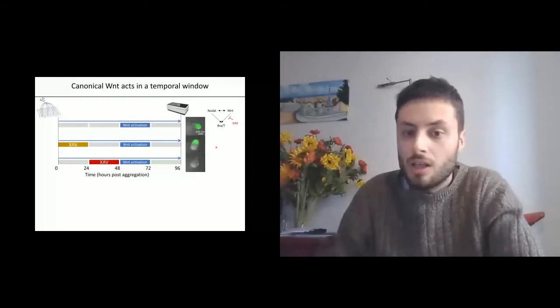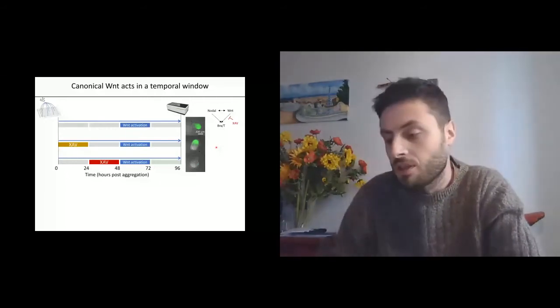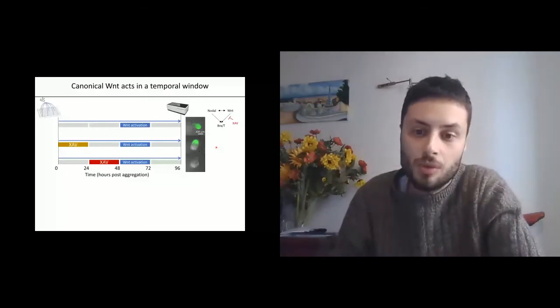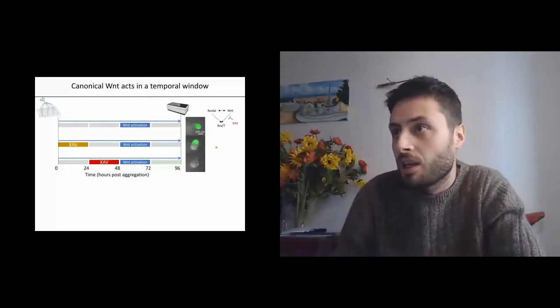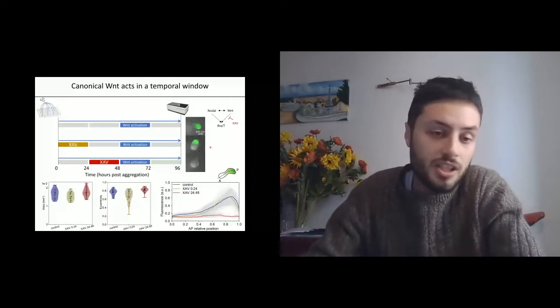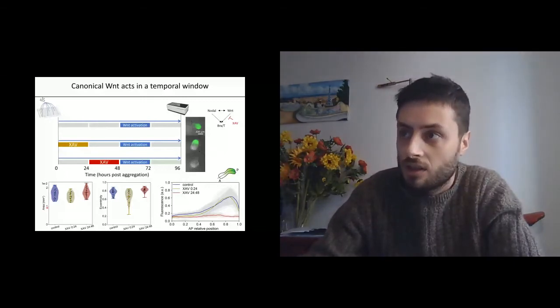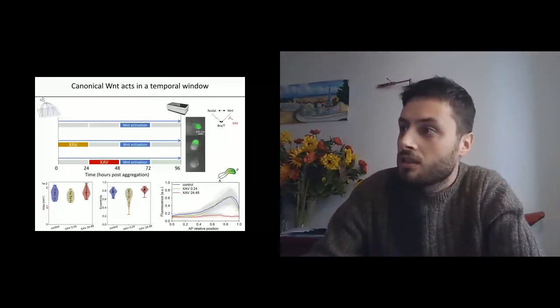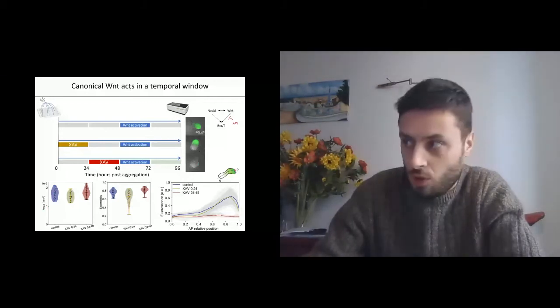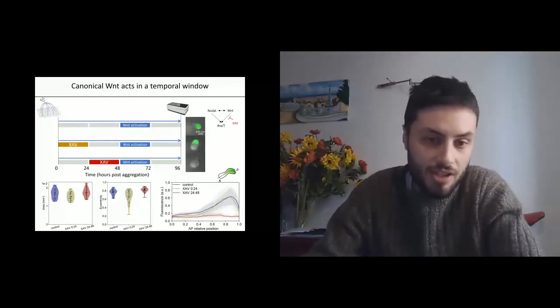So importantly, these images can also be exported easily from the system. And so this is actually what we do. We export the images and we define an image analysis pipeline that allows us to extract the quantitative information that we are interested in. For instance, in this case, the area of the gastruloid, the eccentricity, or the anterior-posterior profile of the fluorescence intensity, which informs us on many aspects of the phenotypes that we observe.